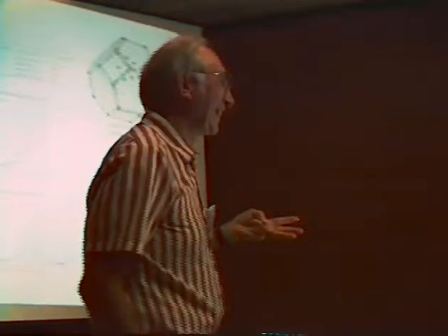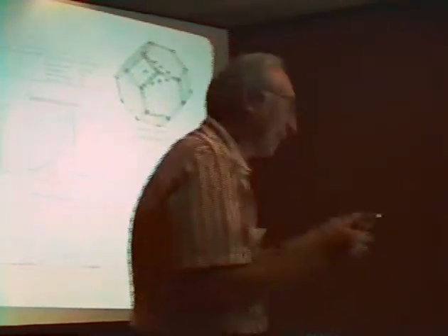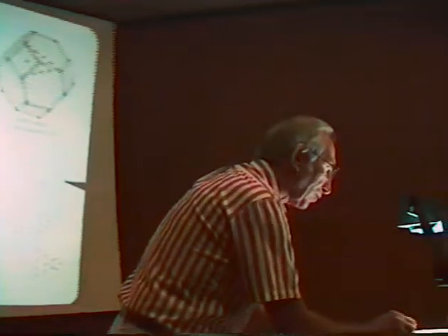And the point that I make here is there are three bands and three main sites, and you get it wrong if you say one band for each site. This band comes from isolated molecules on isolated edge atoms.